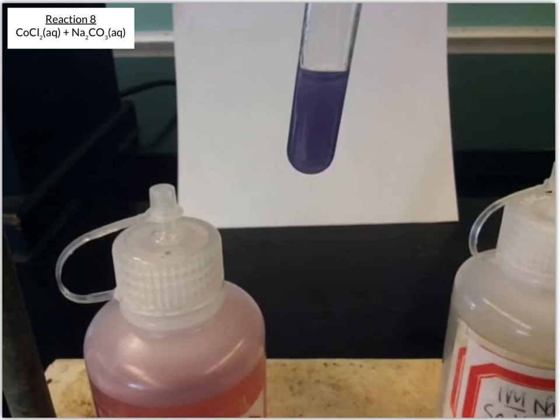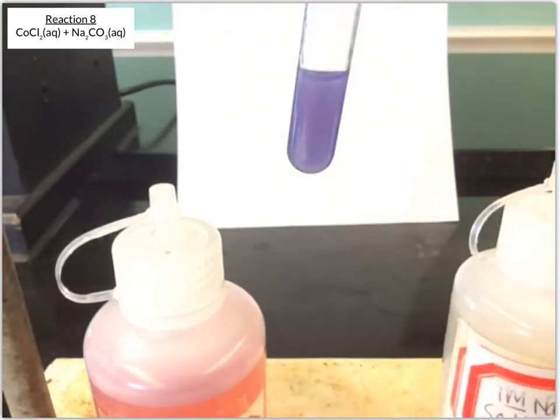So we'll give it a few minutes to settle and see what it looks like after giving it a chance.